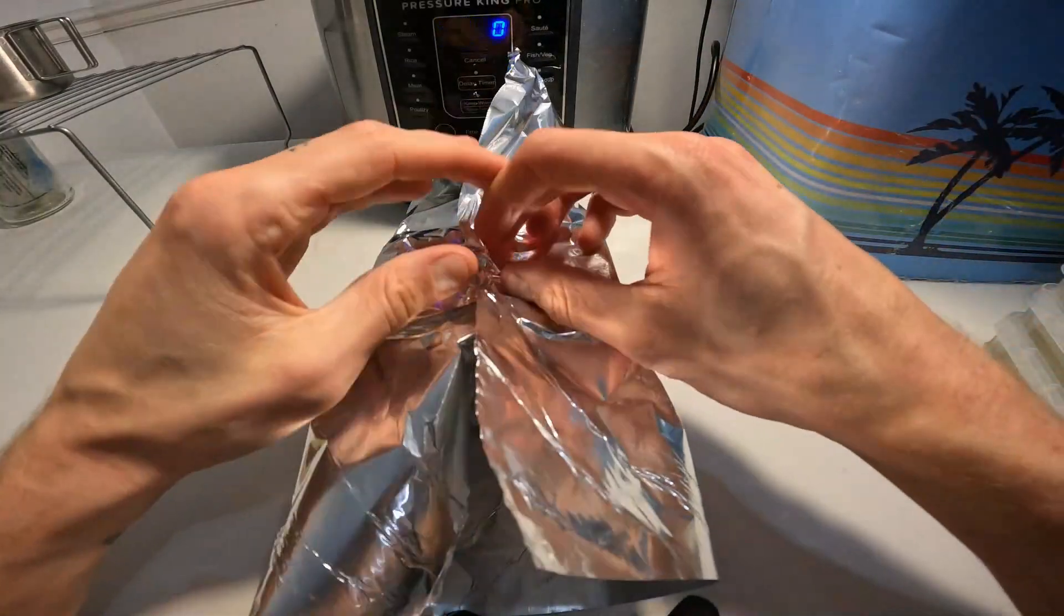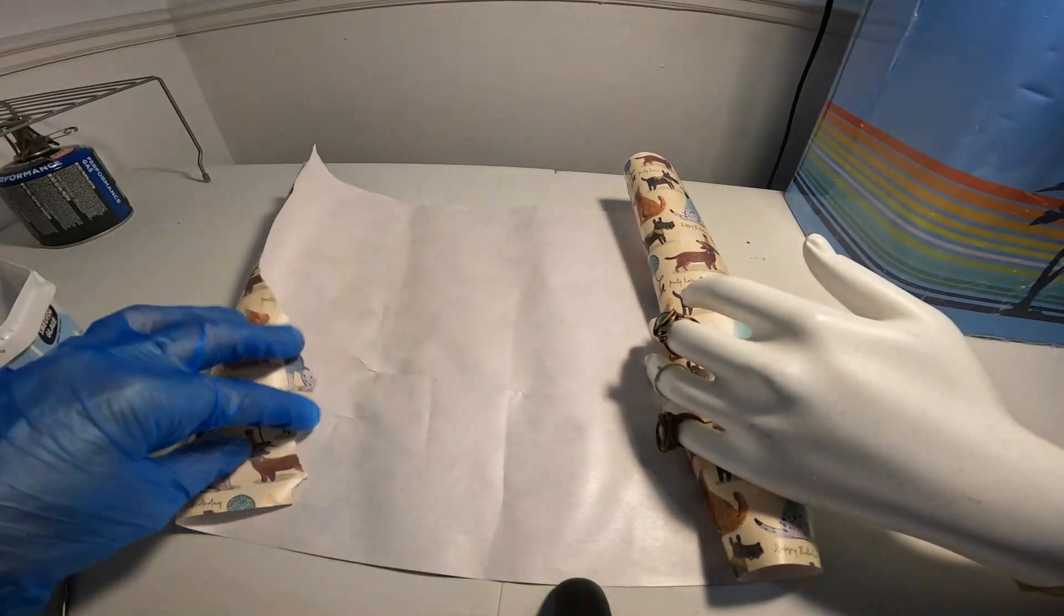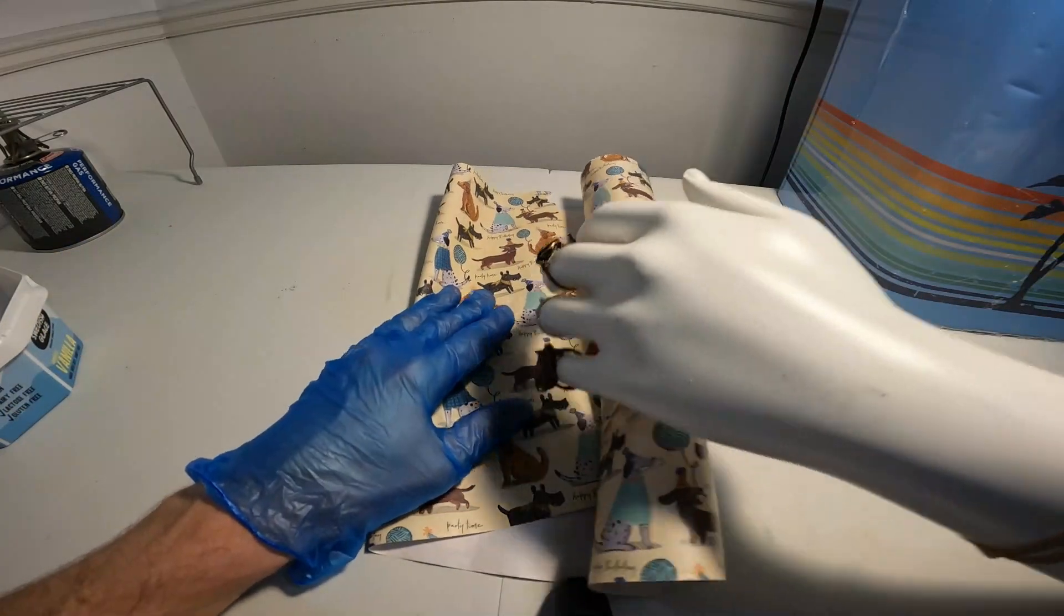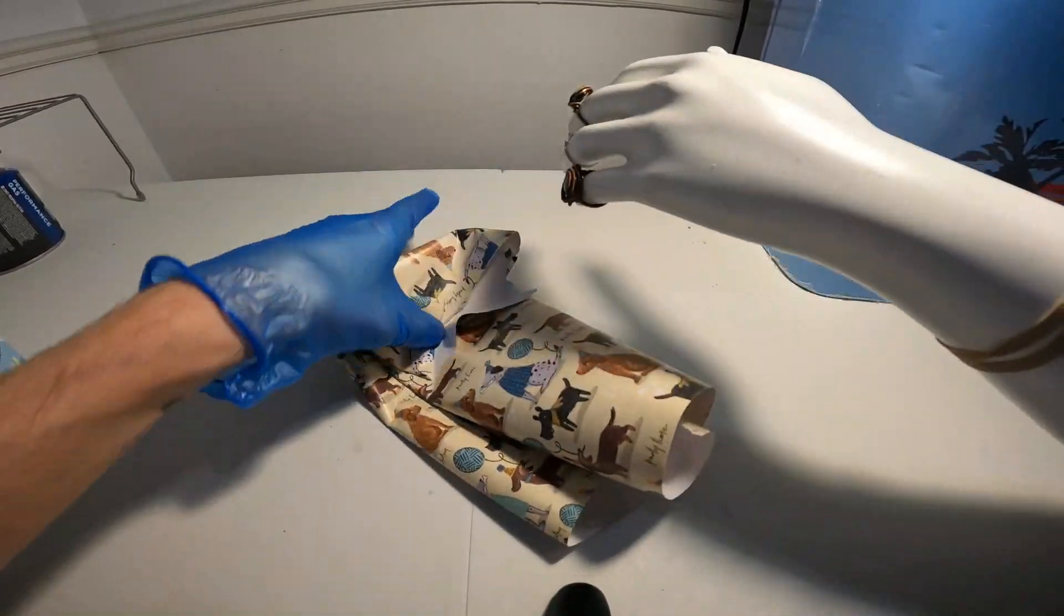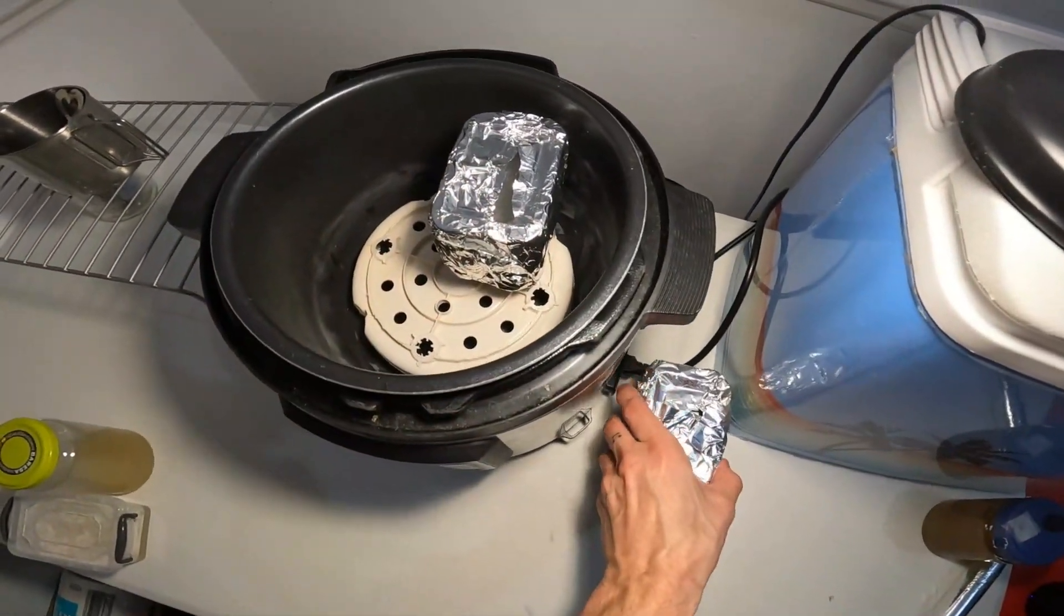I used foil to protect the pots, wrapping them at the same standard that I gift wrap items. Now that they're disguised as an Indian takeaway, they can go into the pressure cooker.